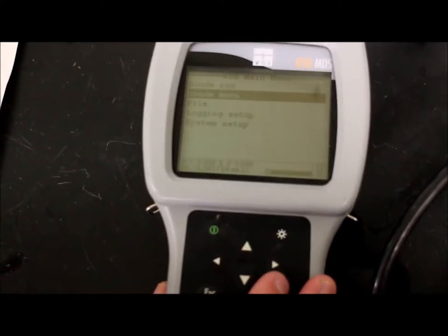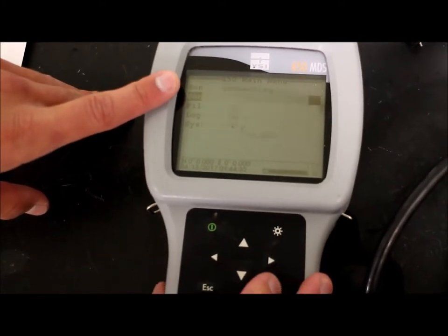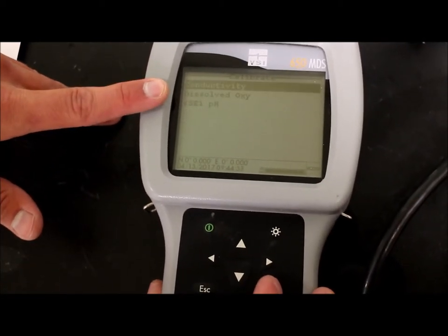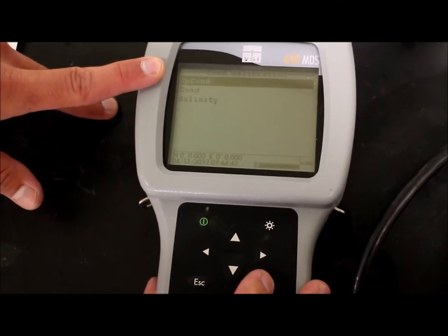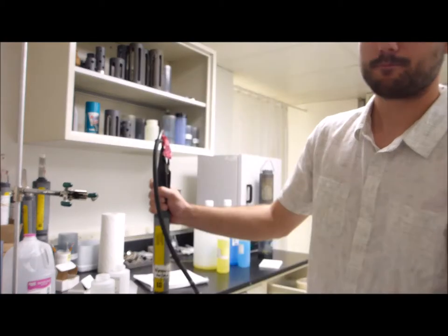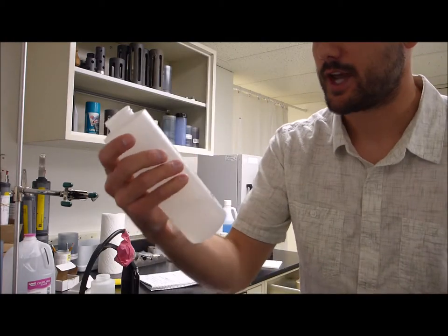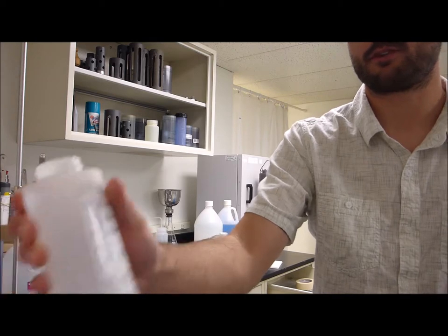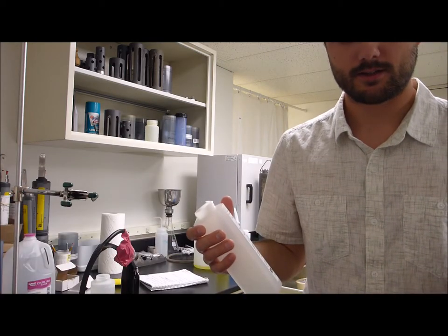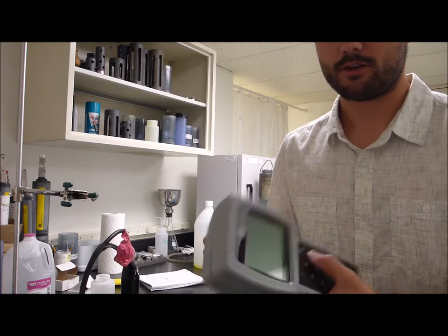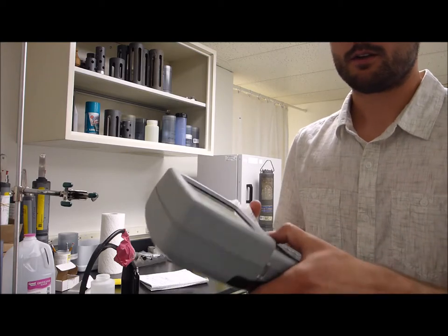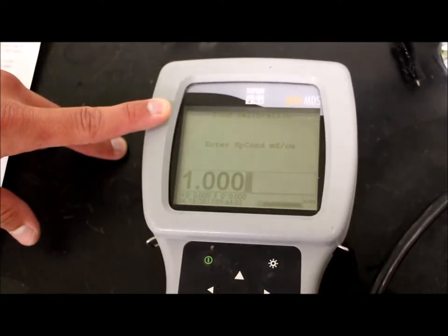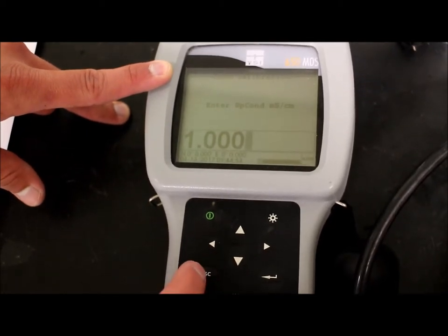So then you'll pull up your hand pad and turn that on. We're going to go into the SON menu and then calibrate. Then we'll go down to the conductivity option, because that's what we're calibrating here. And then we always calibrate specific conductance. So on here it says SPCOND, you'll click on that. Each bottle of solution has a set point. So this is 1000 microsiemens per centimeter, so that's a unit of measure for conductivity or specific conductance. On most hand pads you'll actually have to enter that value in millisiemens per centimeter. So what we do there is 1.000, 1000 microsiemens, 1 millisiemen. So we'll enter that, hit enter.